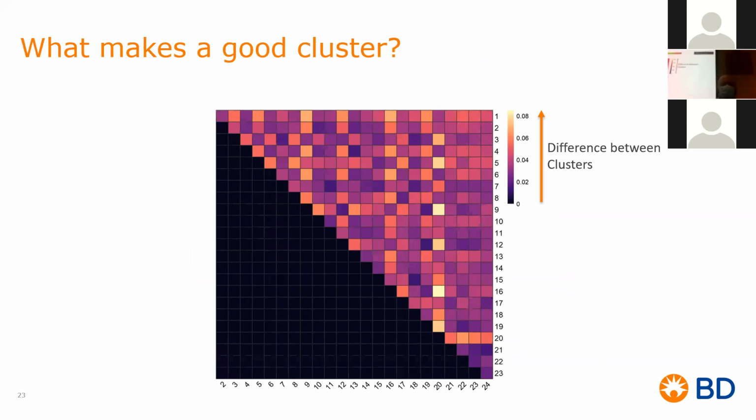Okay, but I picked up these clusters. They make sense, sort of. I mean, why do I say sort of? Because I don't know if these clusters are actually of high QC. All I know, they're about in the right location, but I still need to evaluate those clusters. So that's where it takes us to one of our plugins called Euclid. In Euclid, it gives you 2 different visualizations. This is one of the 2.